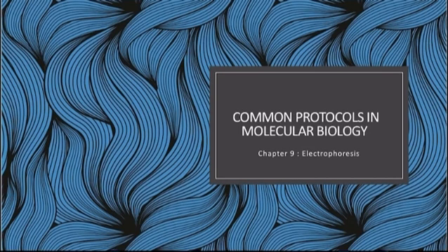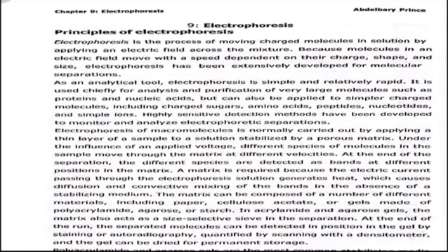Common protocols in molecular biology. Chapter 9. Electrophoresis. Principle of electrophoresis. Electrophoresis is the process of moving charged molecules in solution by applying an electric field across the mixture.